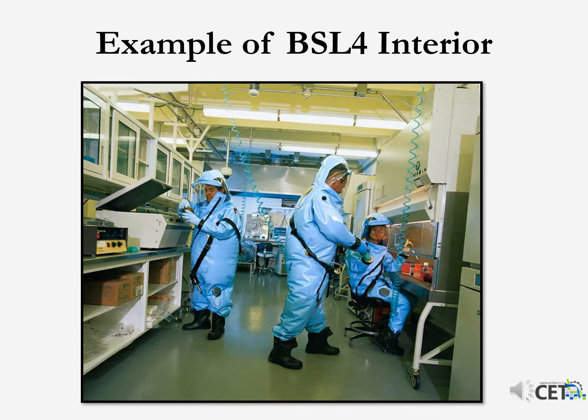So, the people working in these labs, you can see in the picture, have many layers of safety protection on. That safety protection is called personal protective equipment, PPE. The air they breathe, you see the little tubes coming into their outfits? That's air being pumped in from another source outside the room. These uniforms they're wearing are all sealed. They are airtight. All the air that they have comes in and goes out there. It is impermeable to liquids. So these people are wearing extra safety protection, and they're practicing with extra safety procedures.